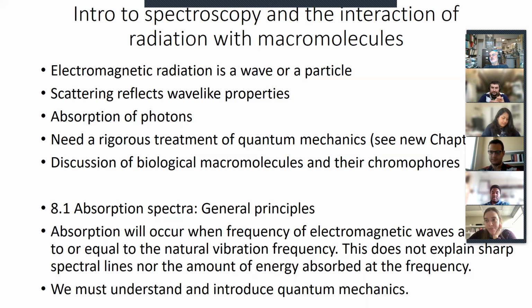And the scattering has certain characteristics, and those characteristics involve wavelength dependence. So certain wavelengths are scattered more or less depending upon their wavelengths. It goes as usually the inverse of something like the fourth power of the wavelength. That will come up in the scattering correction we talk about in absorbance corrections.